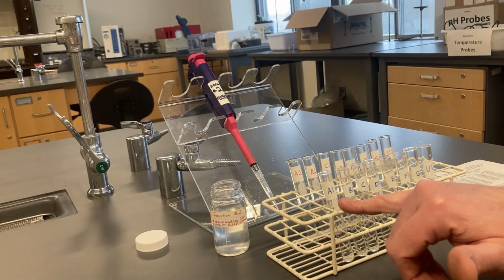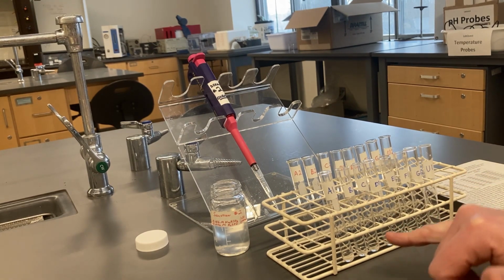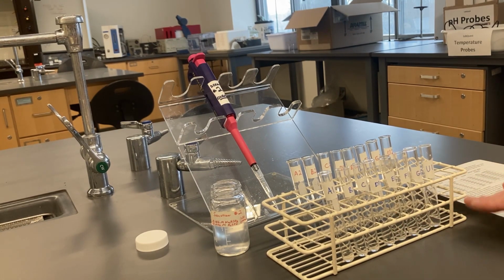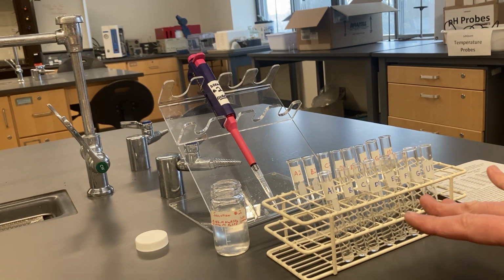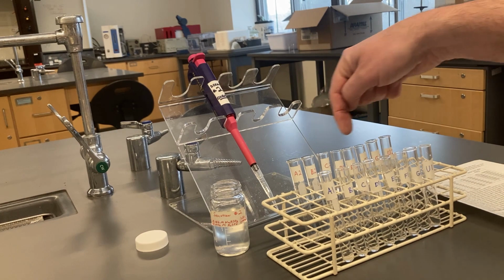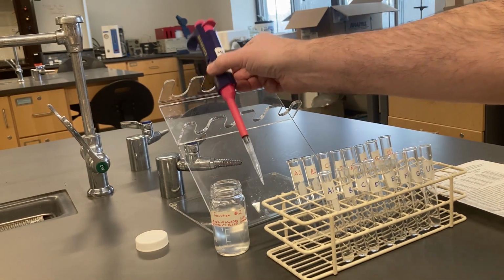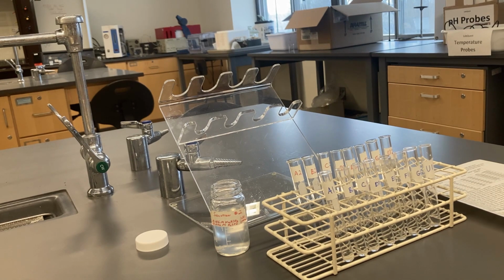So back in all these solution ones, I'm going to be adding distilled water to them to bring them all up to exactly 1 milliliter, 1,000 microliters. But right now I'm going to add my solution number 2 to all of my number 2 test tubes in the back. And A2 up to E2 are all getting 200 microliters.